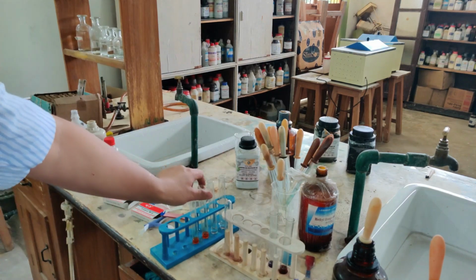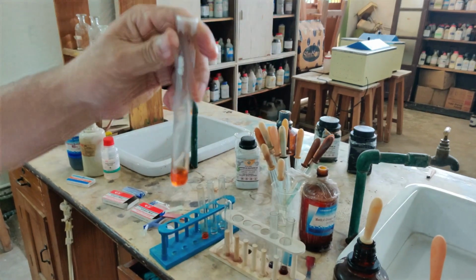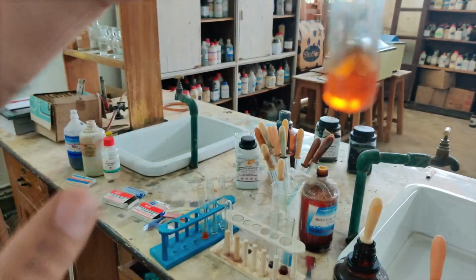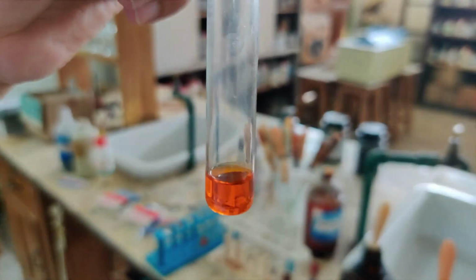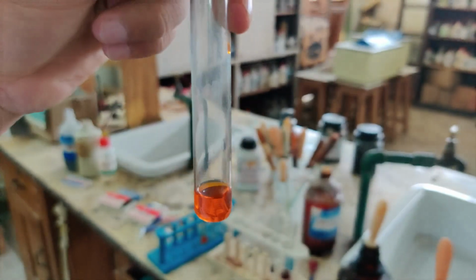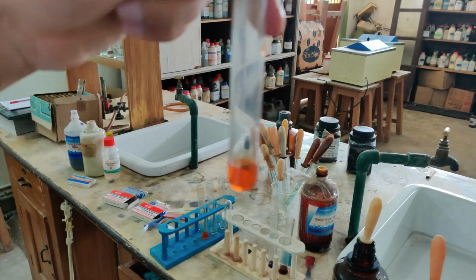Here I have two test tubes of methyl orange. Let me test the first methyl orange with acid. And do not forget, you can see it is orange in color. Again, let me autofocus it. Yes, it is orange in color. Now you will see that the orange color will turn to pink in acid, and it will turn to yellow in base.